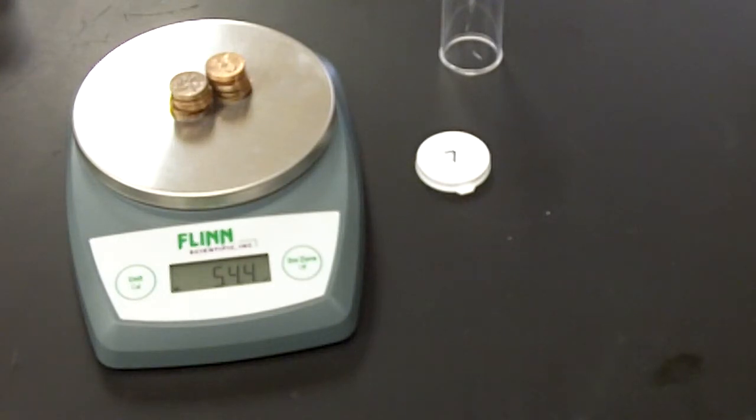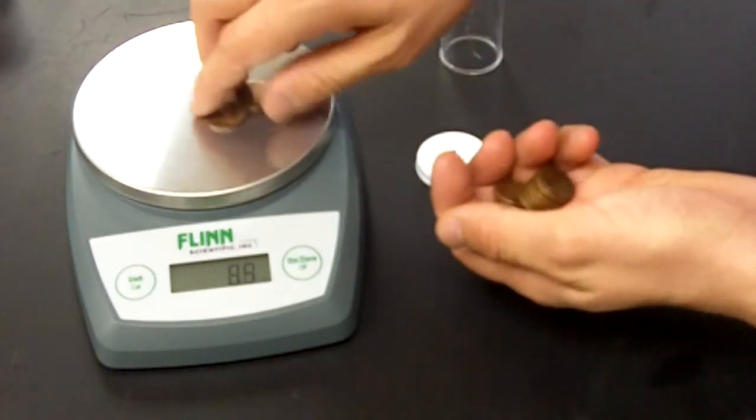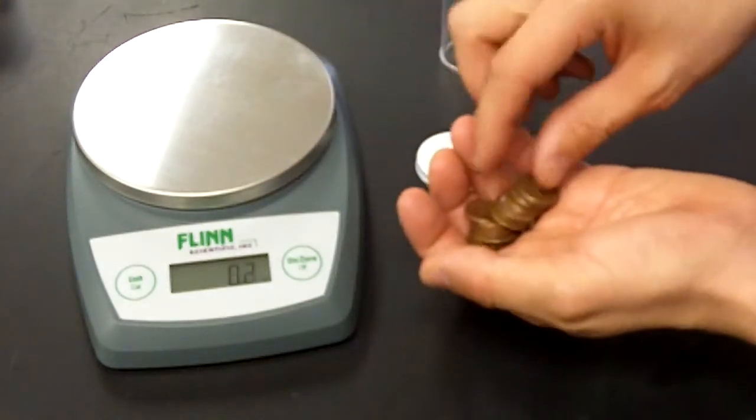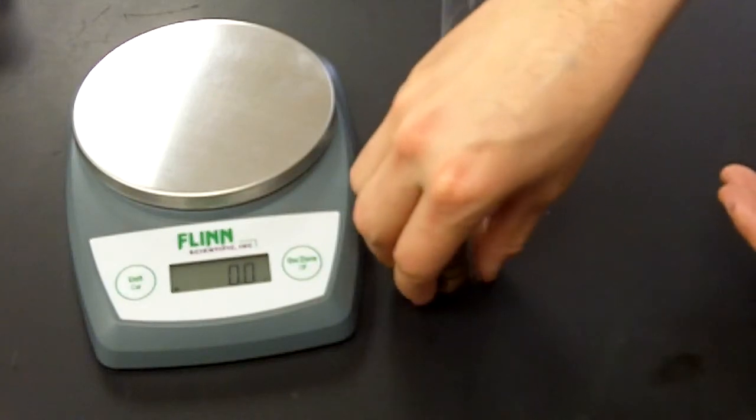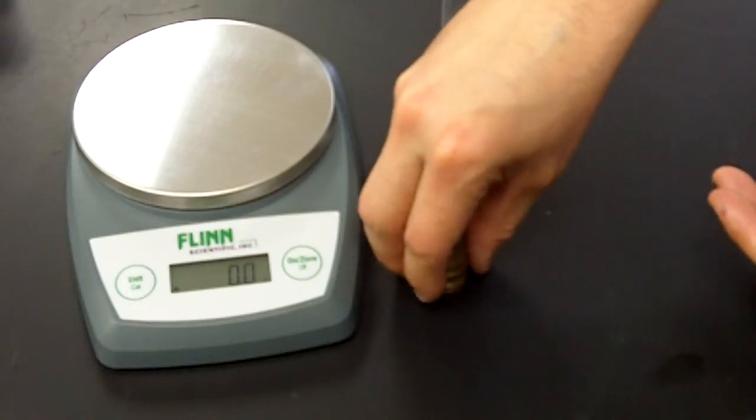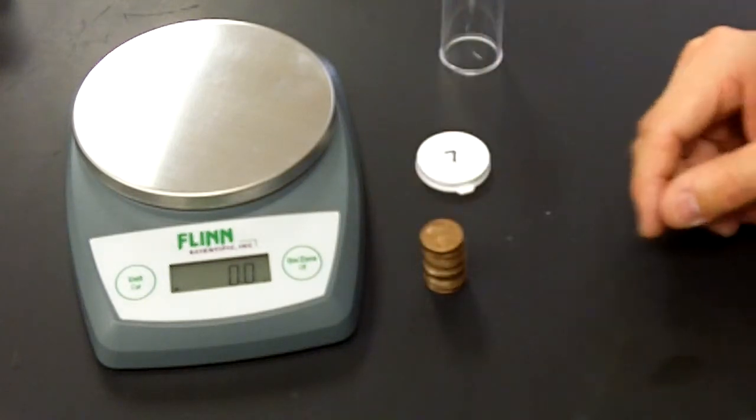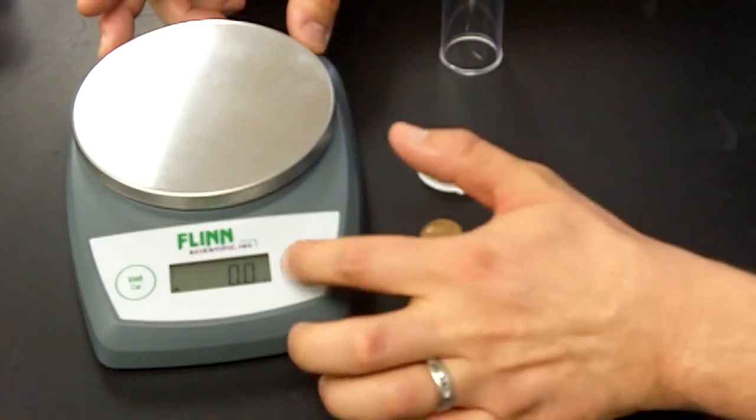Step 3: For each of the individual pennies, record the year the penny was made in the data table. Step 4: Measure and record the mass of the penny to the nearest tenths place in the data table. Steps 3 and 4 we'll do simultaneously. Pulling the pennies off, it's also careful to notice that you want to zero the balance in between each mass measurement. So as we go through these 20 pennies, I'll be indicating the year that the penny was made, placing it on the already zeroed balance, and then reading off the mass.